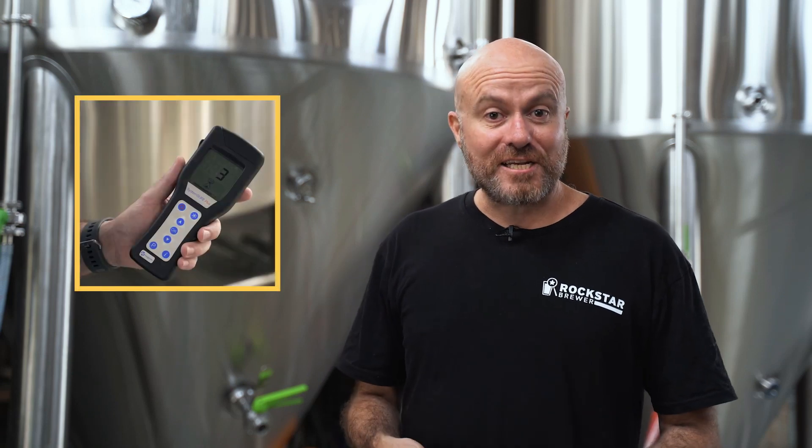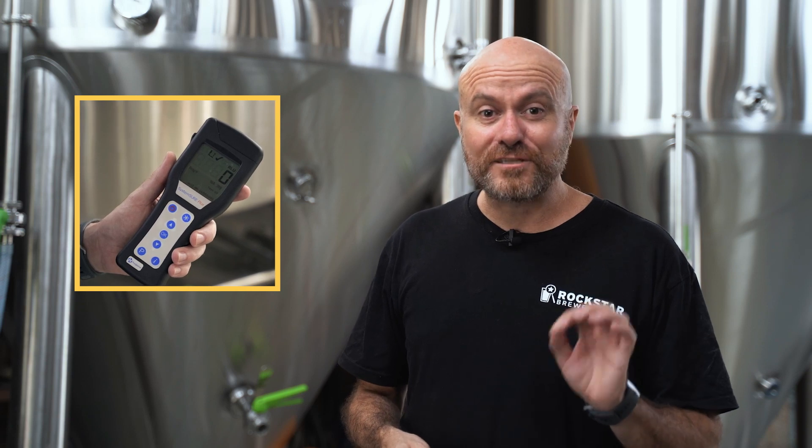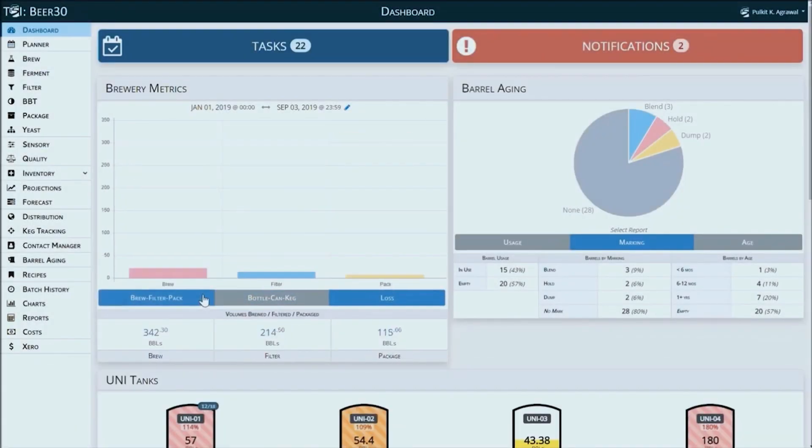So we need a way to check that the tank is clean that's super fast, ultra sensitive, and very reliable. The good news is there's a machine that can actually tell you if the tank's clean or not, and is really really sensitive — and the secret is fireflies.